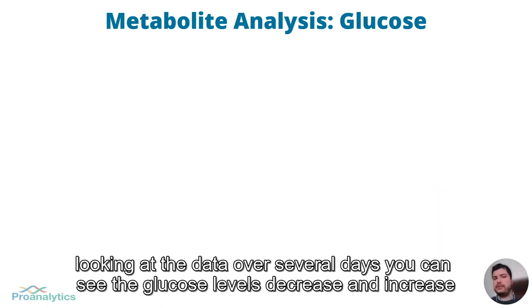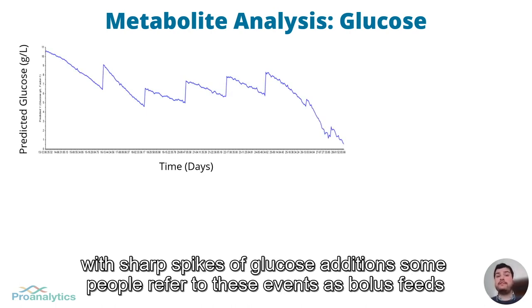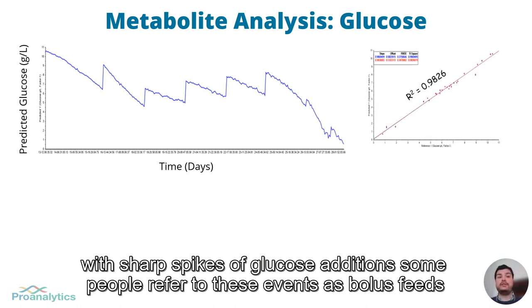Looking at the data over several days, you can see the glucose levels decrease and increase, hence the sawtooth design of the curve. You are looking at pumps turning on over the run with sharp spikes of glucose additions. Some people refer to these events as bolus feeds.